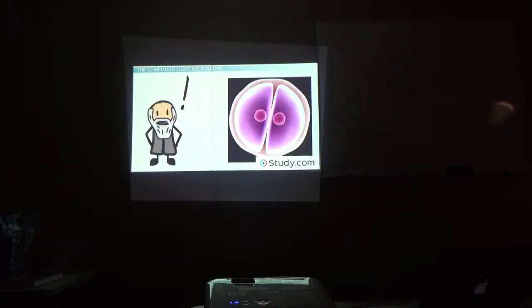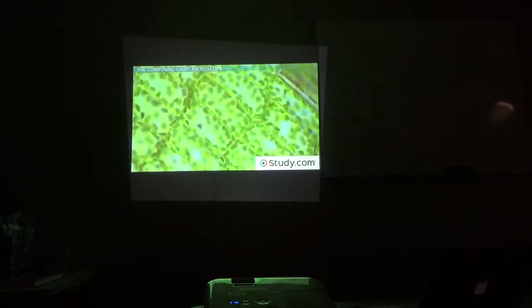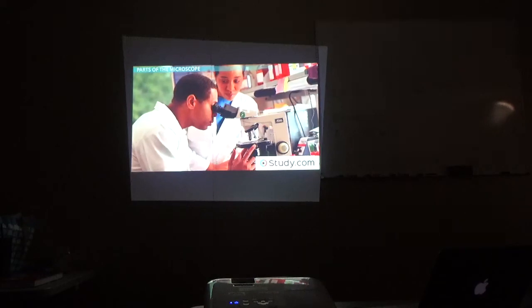Compound light microscopes have been around for quite some time now. They were first used in the 17th century. It's no coincidence that during the same time, cells were discovered, which led scientists to a great number of other discoveries about microorganisms and cell structure and function. Microscopes are very powerful tools indeed, but in order to use one properly, you need a basic understanding of its components.